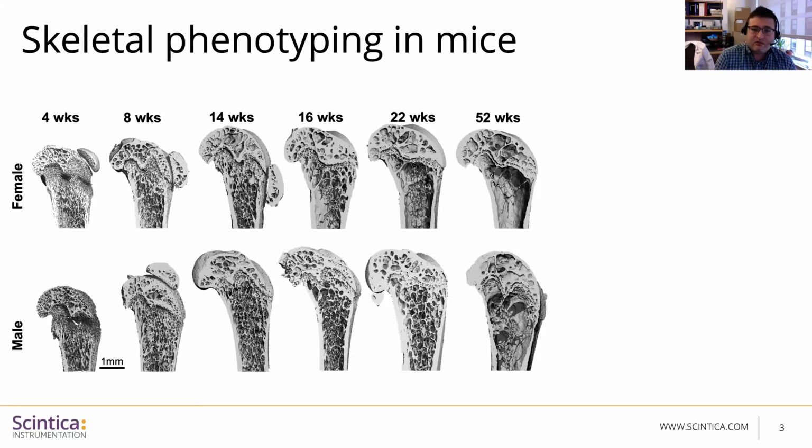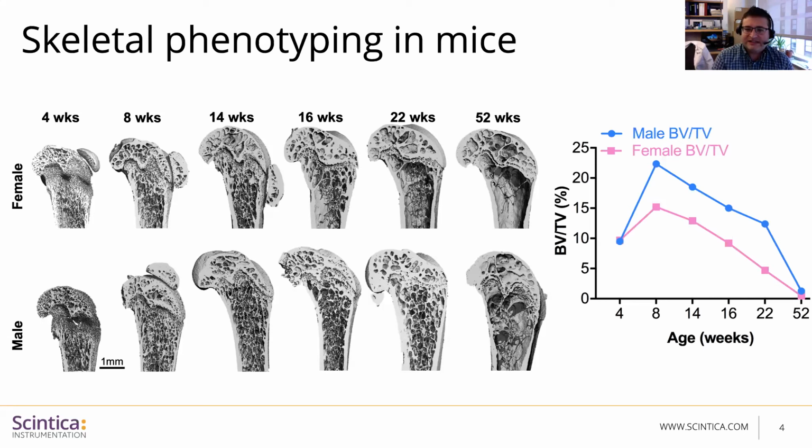So they have invented in vivo models since, but they're not really fast, or at least not as fast as DEXA. I plotted BV/TV, the quantity of bone found inside the marrow cavity, over time. Like I was telling you, it really changes drastically over the age of the mice, and you can appreciate that here. So I think I made the point that all of this together really affects the structure of the bone. And so to look at this, we needed systems that allowed us to look at changes in living mice over time.